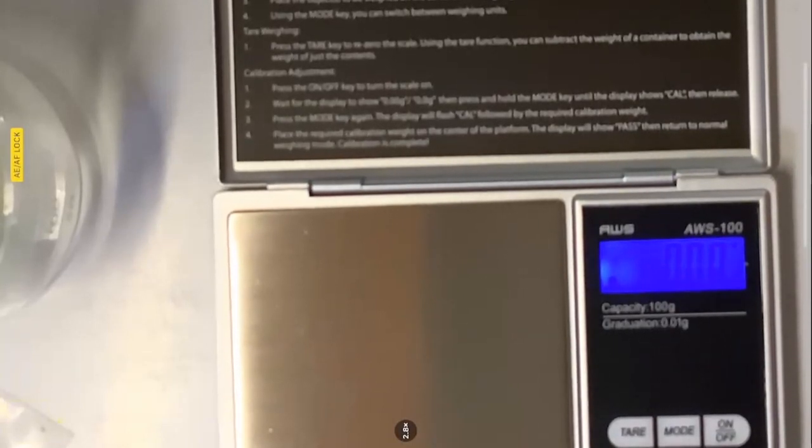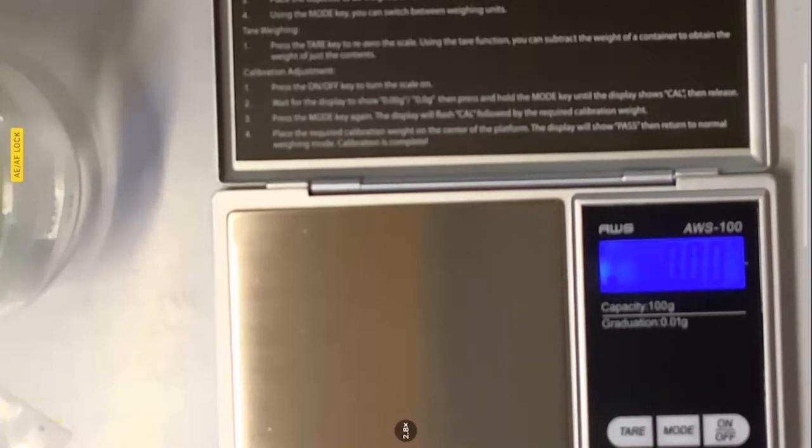And in this particular case, I have about 2.13 milliliters. Okay, I can read that. I think you guys can see that as well. Got to be at eye level, and it's got to be perfectly horizontal. Okay, it's got to be perfectly horizontal.